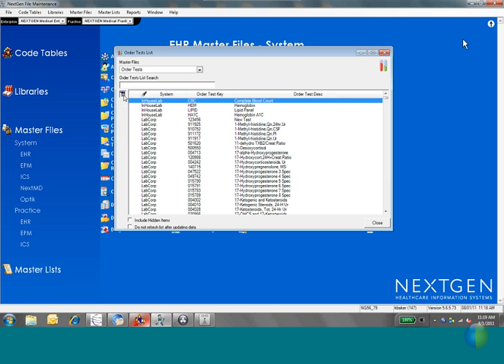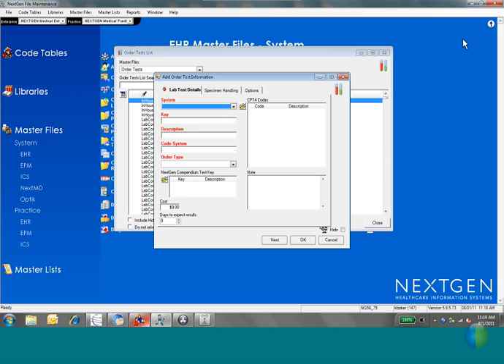When you look at an individual test, if I were to go to create a new one, just to show you what was needed, there are 5 required fields. And these are the fields that get completed when the interface analyst loads the compendium for you. So they will choose the system, which is the vendor. So if I were to be adding Quest, then I would have to choose Quest Diagnostics here. The key is the code by which Quest needs to have the test listed. So it's their independent code. The description is the name of the test. So that would be typed there.